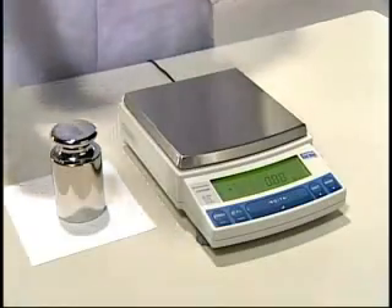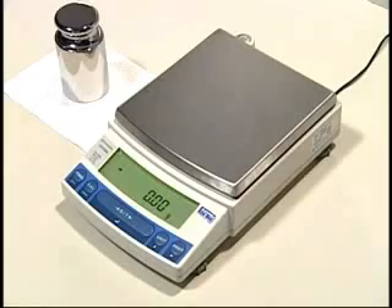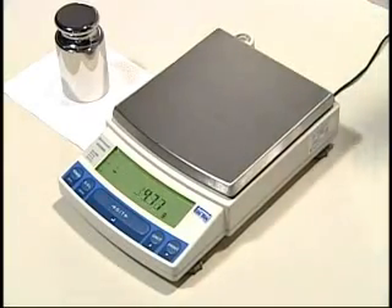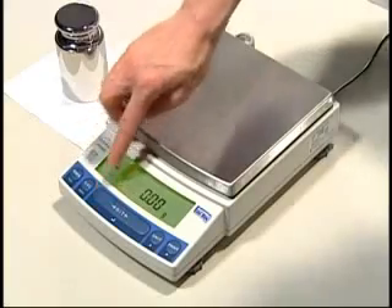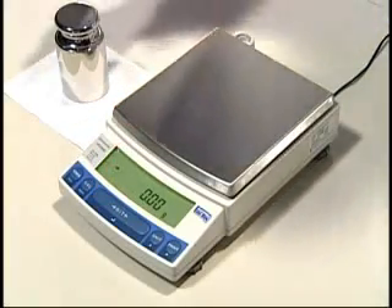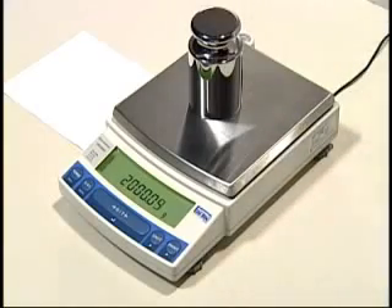What's that? Does the scale still work, you say? Of course! I've got a weight here that is 2,000 grams. See what I mean? How's that for accurate measurement?